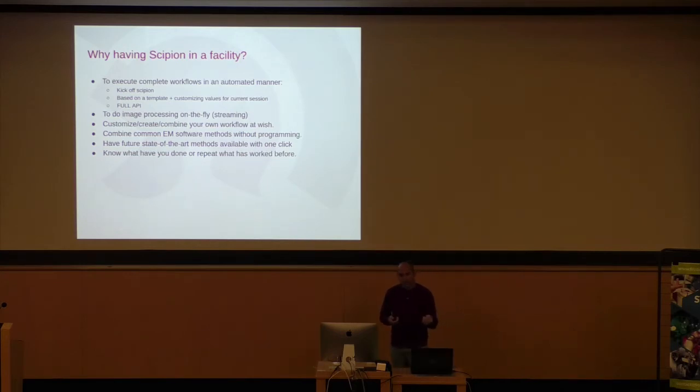Obviously, in Scipion, not all of them, but many of the protocols, especially those at the beginning of the acquisition, work in streaming. That means that as soon as there is a file available, it can process it, register the output, and that output is available for the next box. Before it wasn't like that, but now it works like that. So as soon as you have something, the other boxes can consume it, and you can basically have your particles or 2D classes while you're still acquiring and getting movies.